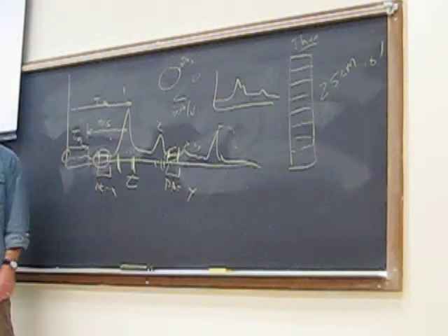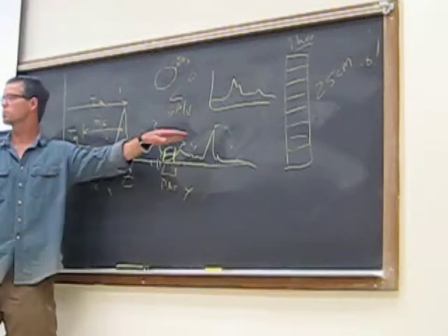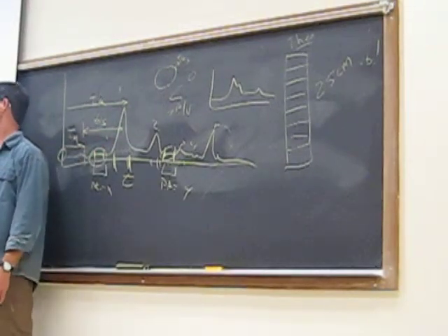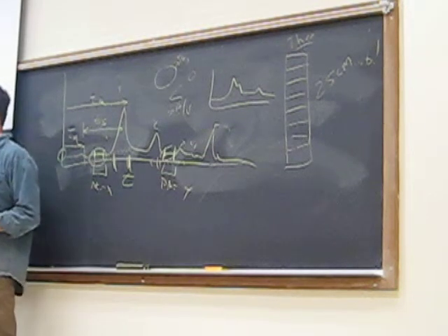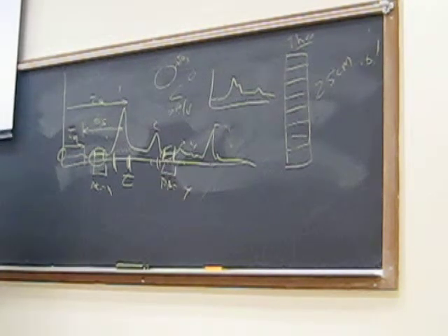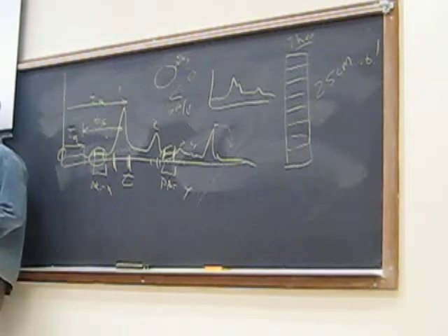The baseline noise, in principle, should not really change over the course of elution, because it's coming from the detector. So when you find that number, you multiply by 3. Okay. And then what do you do with it?